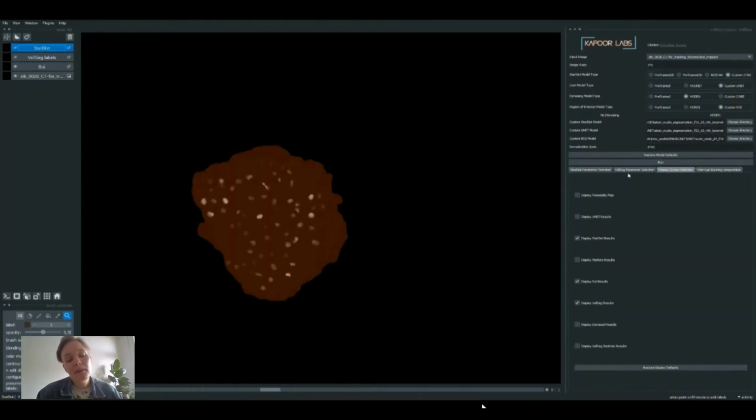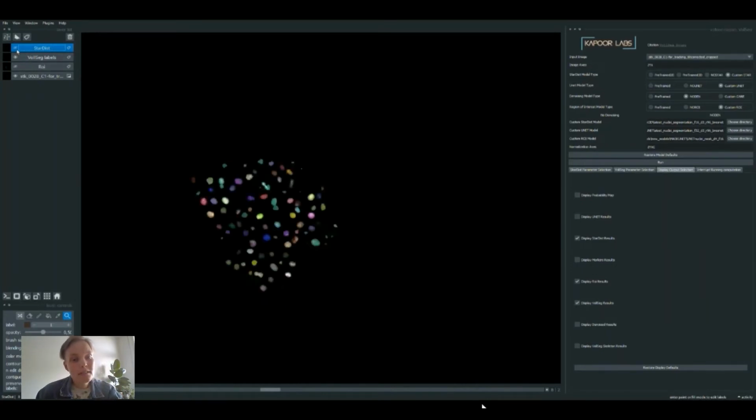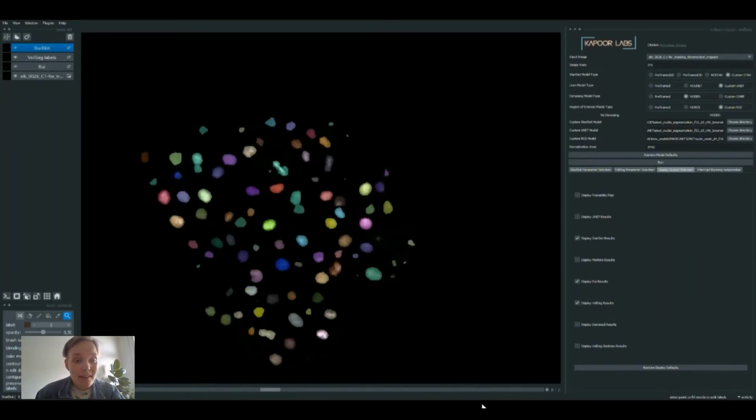Now, when we do apply the ROI model, the segmentation and the normalization are only applied to the segmented ROI and its bounding box. So then we actually get a successful segmentation of these nuclei also in the early time points.